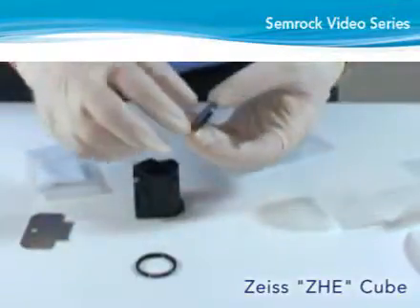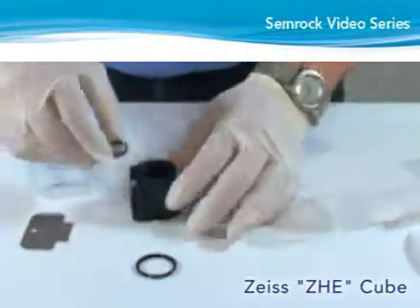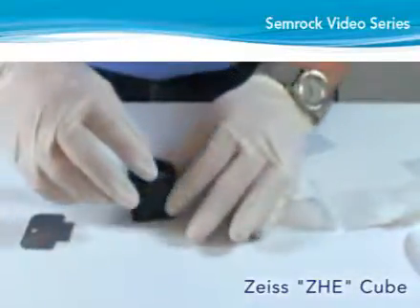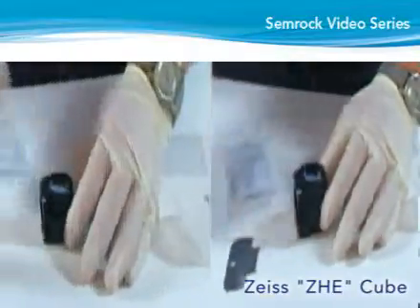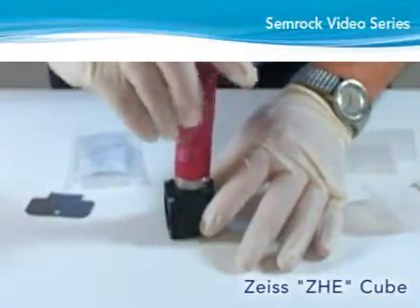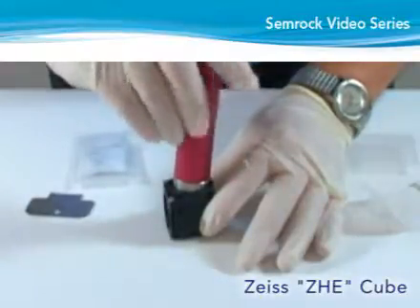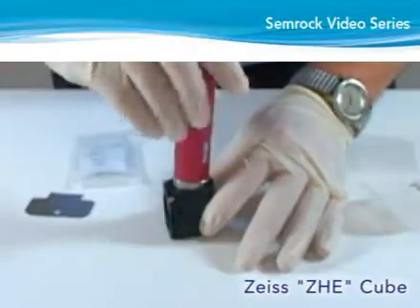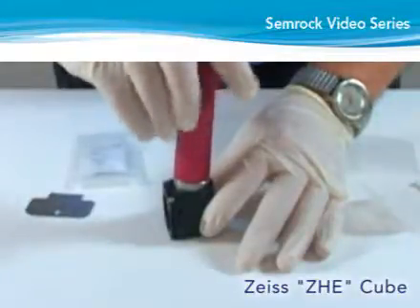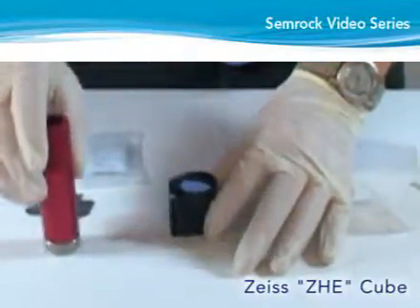Place the filter inside the emitter mounting hole with the arrow on the side of the filter pointing outward. Insert the filter retaining ring with the open side toward the emitter mounting hole of the cube. Note that the cube threads are tilted at a five degree angle. Begin screwing the retaining ring clockwise, but be careful to avoid cross threading. If the ring will not turn, it is not threaded properly. Slowly screw the ring a partial turn counterclockwise until you feel the threads click into place, and then commence screwing in the clockwise direction. Using the spanner wrench, carefully turn the ring while observing its position in the threads and keeping the ring level. Tighten the ring snugly against the emitter filter.